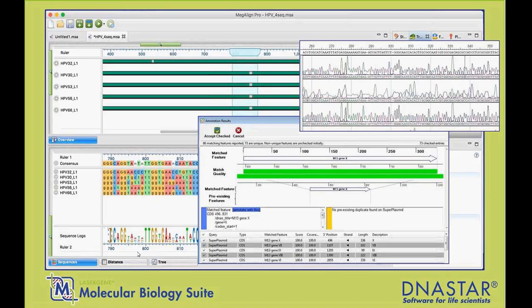You can see there's some multiple sequence alignment. So we can align DNA and protein and look at things like trees and multiple alignment diagrams. We also have Sanger sequence aligner and editor. That's very good. And we have some new tools for auto annotation. About a month ago, we had an auto annotation for plasmids added to our Seq Builder program, and it provides a really nice interface then for adding annotations and accepting them. So it's really a wide-ranging set of tools for molecular biology, and again, we have separate webinars that cover all those specific topics.